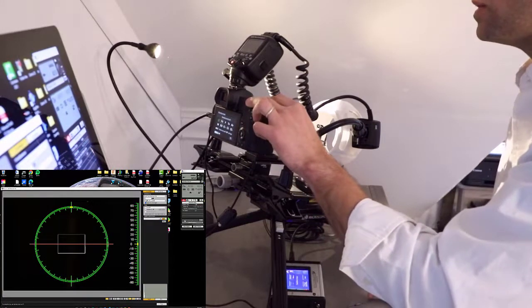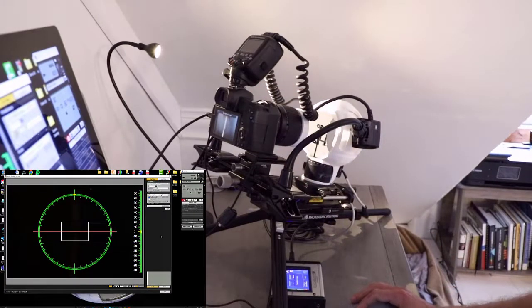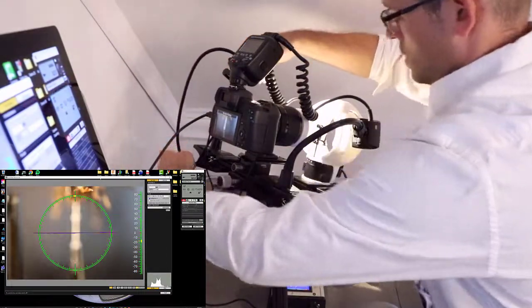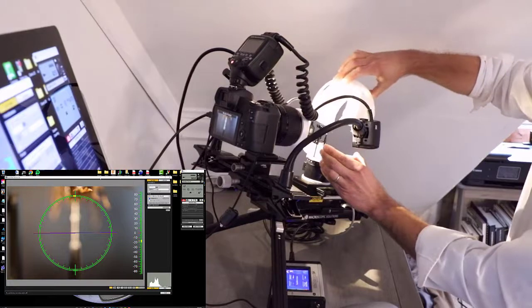I'm going to go to its automatic function on the DSLR. The automatic function is going to allow us to see what we're looking at. We'll move the light down a little bit just to give us an idea of where we are. Okay, we also want to bring the specimen down a little bit, so we'll move the entire stage down.